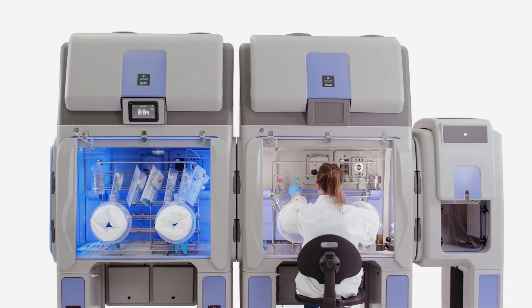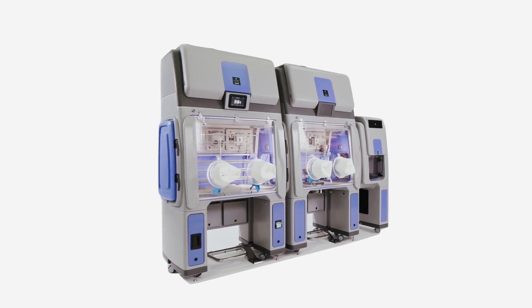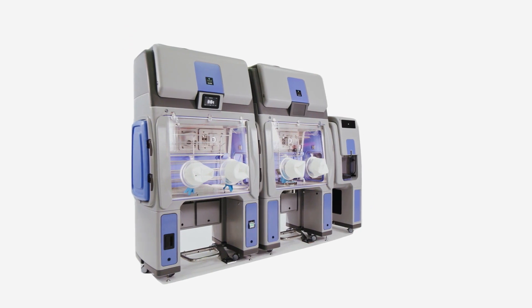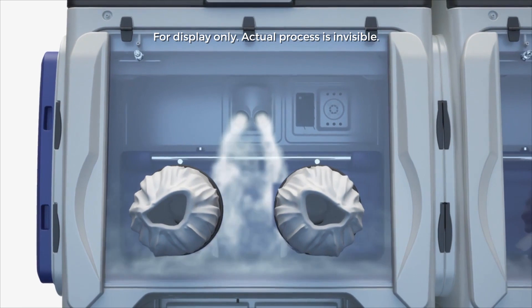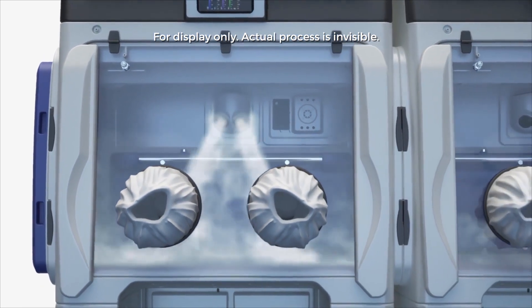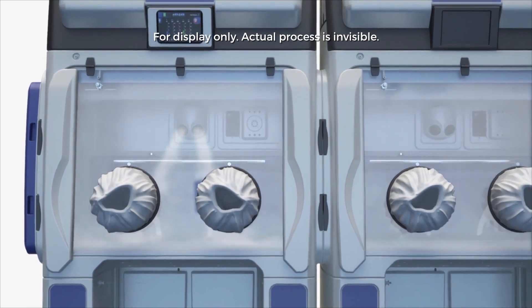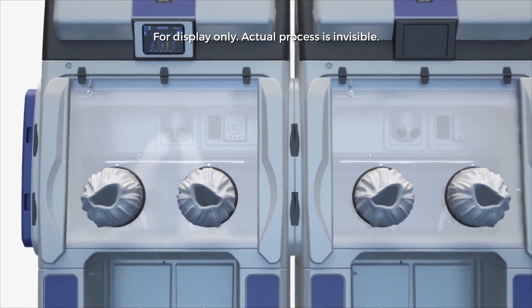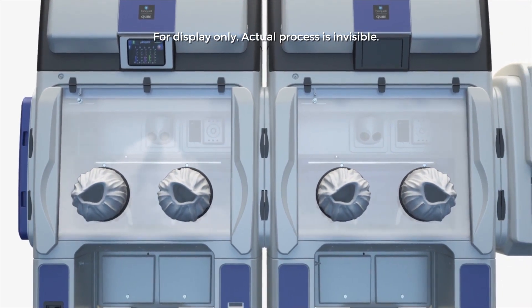This is where the Bioquell Qube is extremely beneficial. The Bioquell Qube provides an aseptic, Grade A environment in which to perform this process. The Bioquell Qube also has an integrated decontamination system using hydrogen peroxide vapour, which results in the surfaces of materials loaded being decontaminated before they are exposed to the critical process.